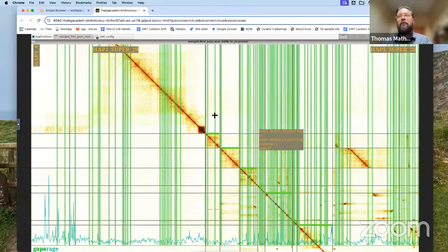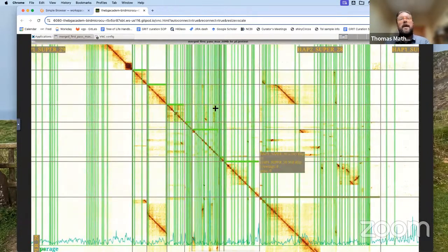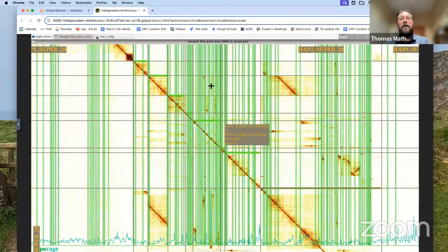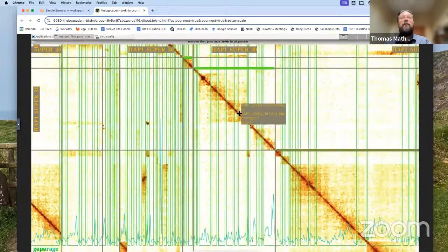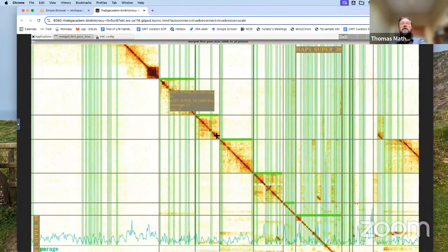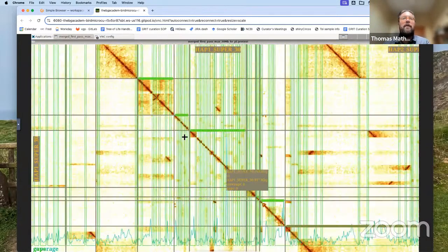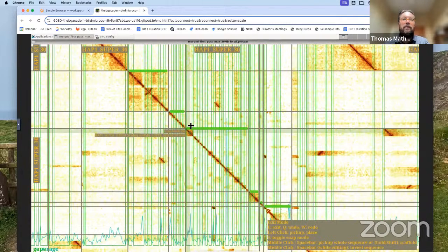Move it to the start. And then because we're curating both haplotypes together, we'll want to have the corresponding sequence from the other haplotype as well. So we can start to build these up. Here's one, another chunk which all goes together. We probably might not expect to be able to place all the content that's been identified as potentially microchromosome into defined chromosomes, because some of it will be too small or too ambiguous. But we can try to build up these units as best as possible.